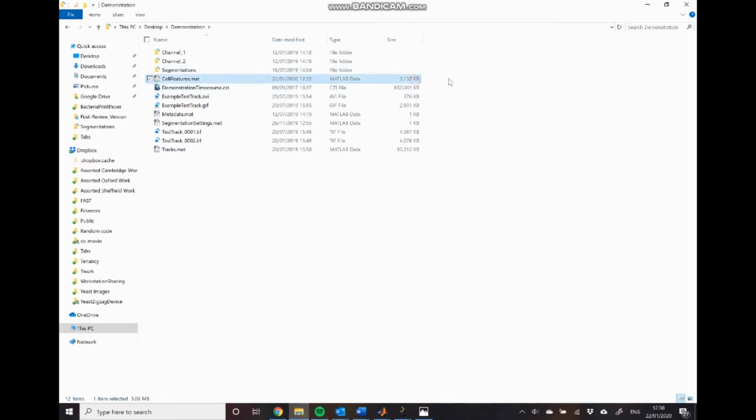So this contains all of the salient information that we're going to be using during the tracking stage of the algorithm, and you can see it's very much compressed relative to the original imaging dataset. That's going to give us a big speed advantage, both in terms of loading data and in terms of processing it.